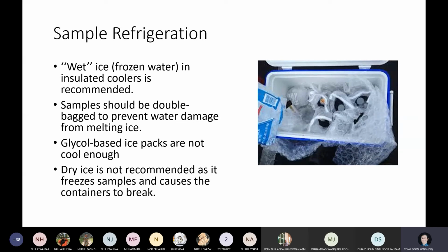Oh, by the way, do you know why we use only good quality ice boxes? Do you know why? Because if you use polystyrene, I know there are cheaper ice boxes, the white colour polystyrene, 10 ringgit each, you can use that. But imagine you are storing water and they also break very easily. You have a knock, then all the ice water is gone, then what? Your samples are all gone lah. So that's why we don't use cheap things. We use a durable plastic ice box. We use durable sample bottles, things like this lah.